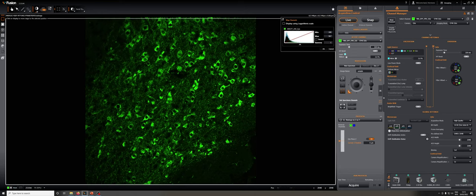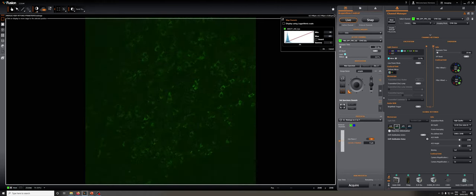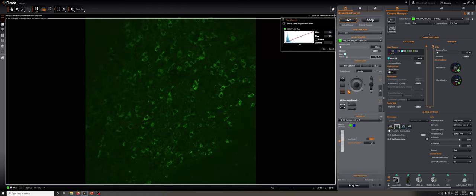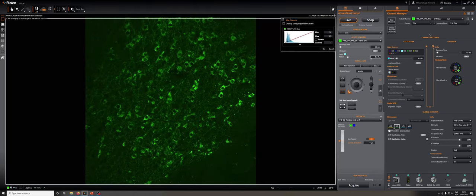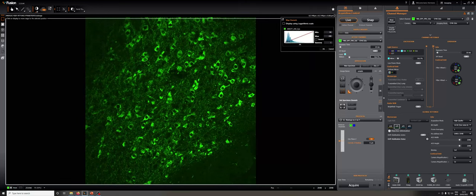Something similar can be done with the laser power. So if I go back down to 10 milliseconds and I start increasing the laser power from 2 to 4 to 8 to 16, we can see the quality of the image getting better.